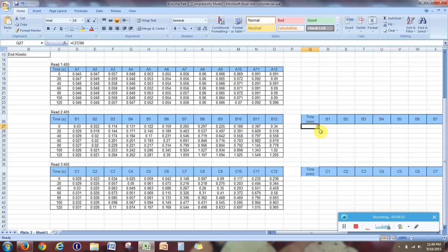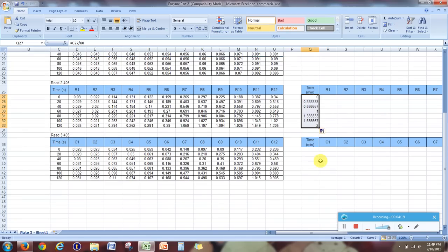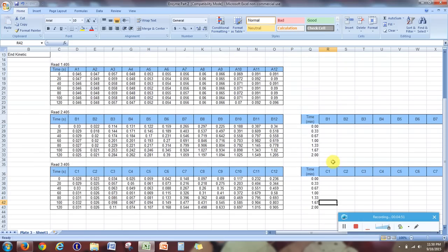And then to copy and paste, there's a small black square. You can click on that, and it'll copy and paste down below. Now, one thing that Excel often does, especially with repeating decimals like this, is it will give you an unnecessary amount of sig figs, or maybe too few sig figs. So just to show you, there are these two buttons up here. You can increase decimal or decrease decimal. So we'll just do something sensible, maybe 2 decimal places. And then we can copy and paste it down here as well. And I usually use my keyboard quite a lot, hitting the escape key to deselect this, but I'm going to try and use my mouse as much as possible so you can see what I'm doing.